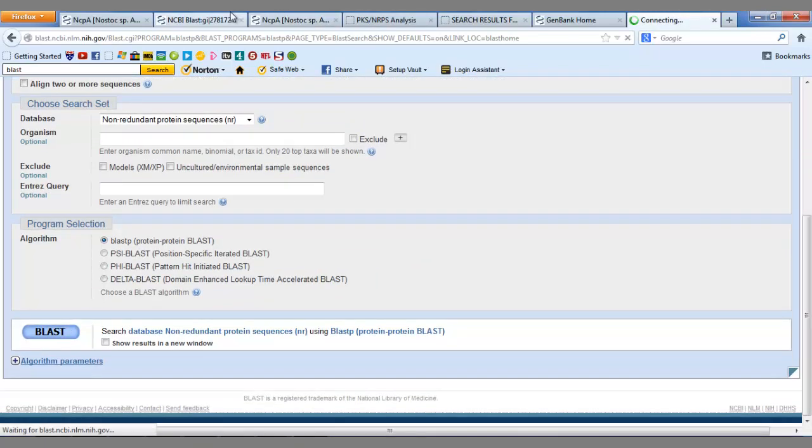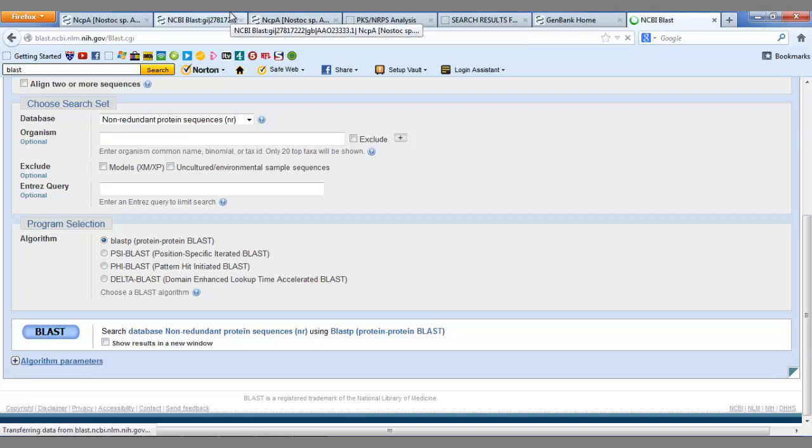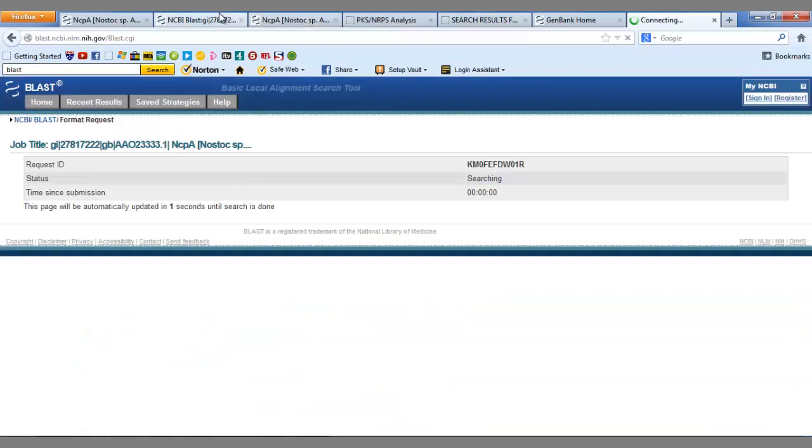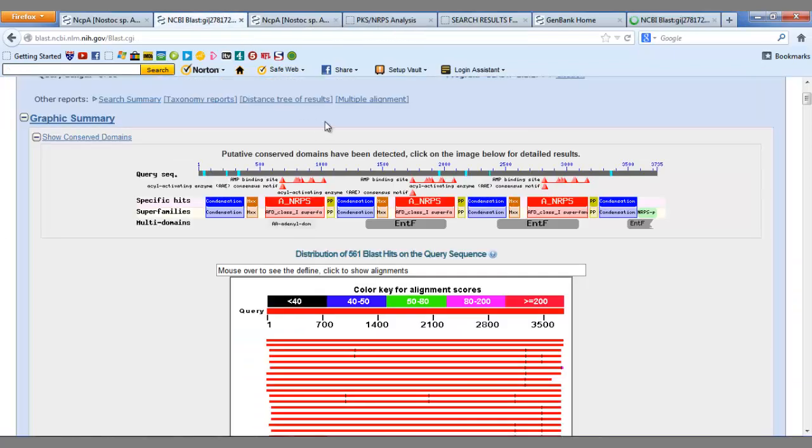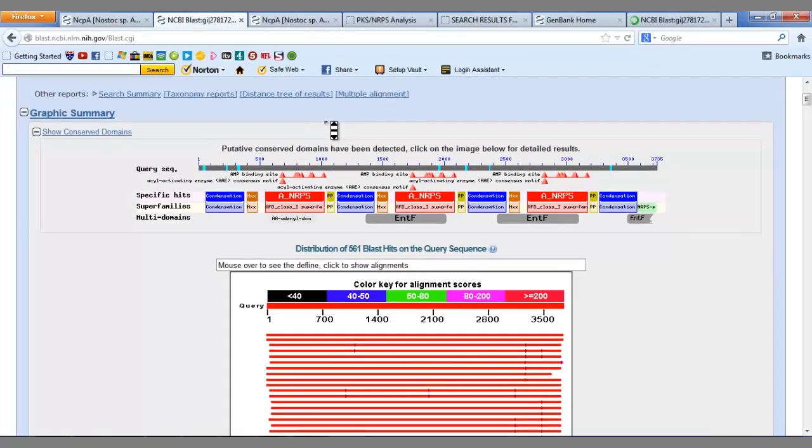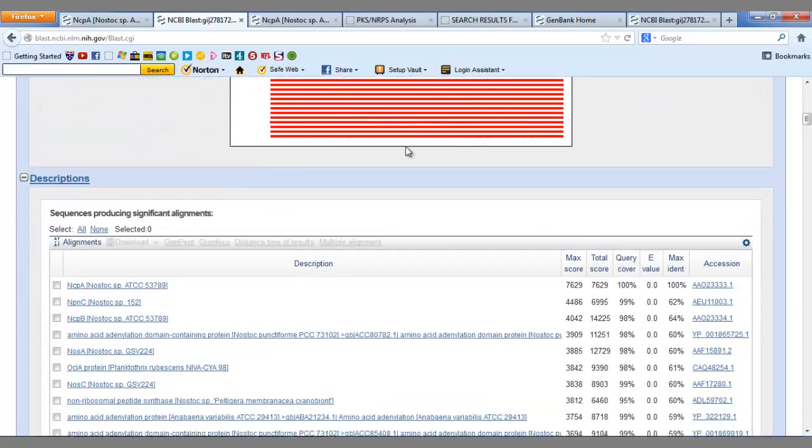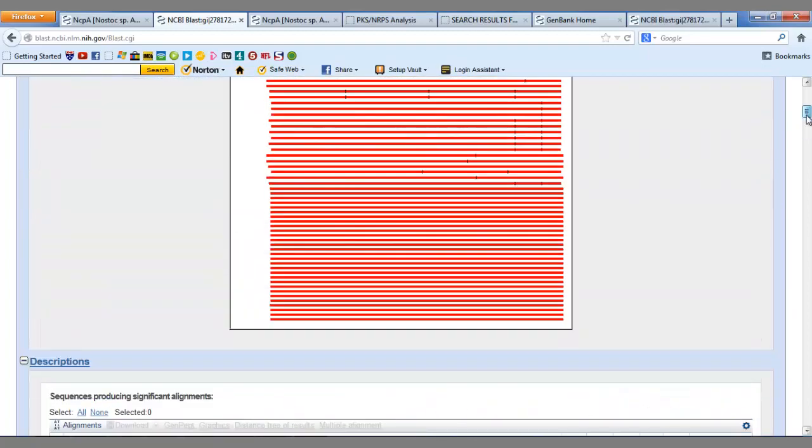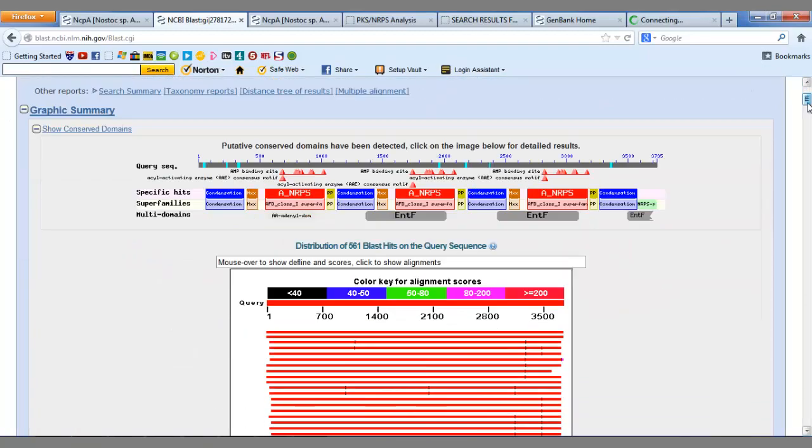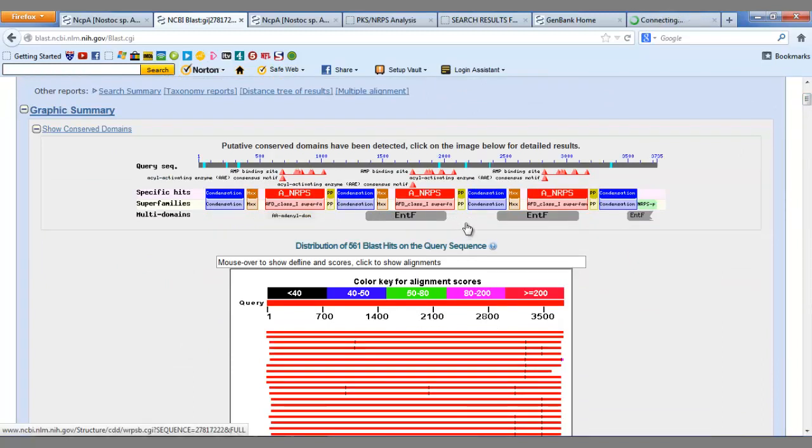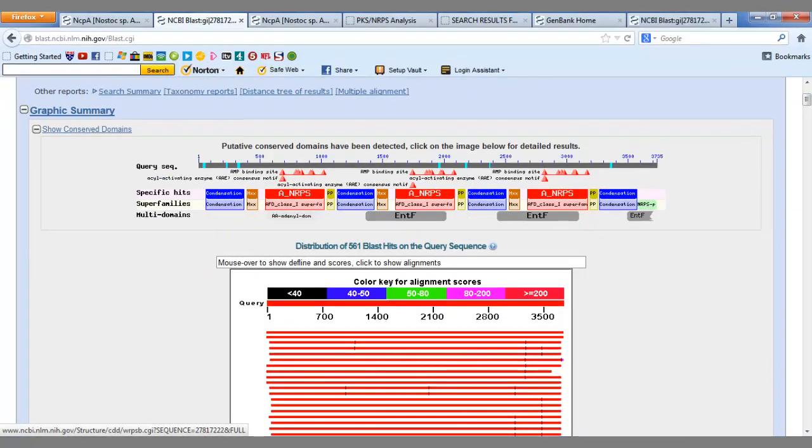After blasting the sequence, we come to a page that looks like this. We are given a lot of information, but we shall focus on the visual results. We can see that BLAST has found the exact components from the highlighted region in Artemis, shown next to specific hits.